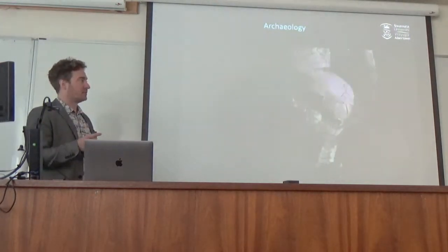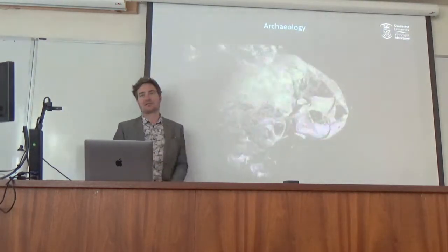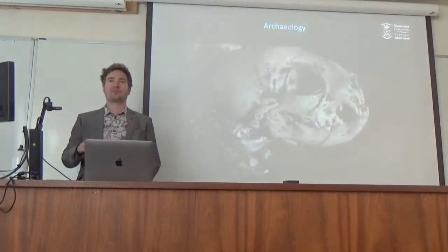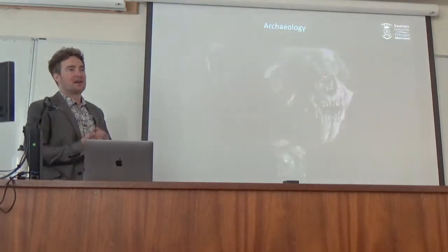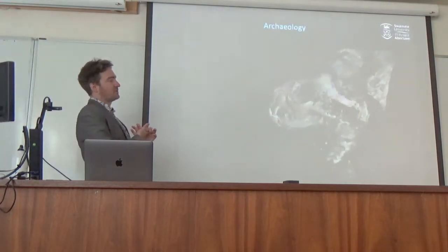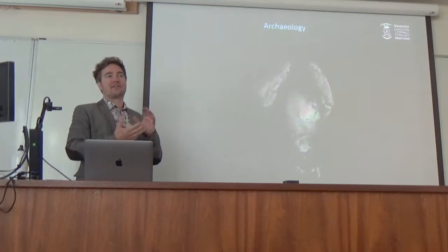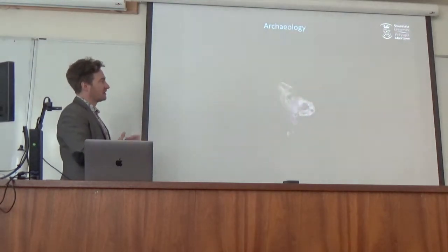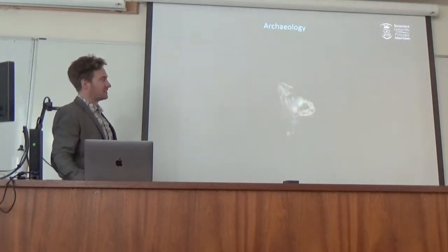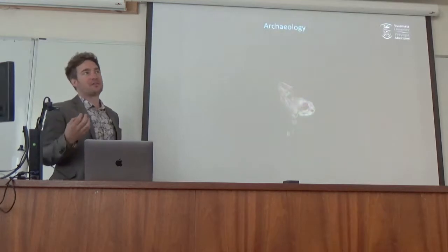So when we're collaborating with an expert on animal bones across the country, the visualization becomes so important. We want it to be accurate, but it's hard to get it usable because they're not able to manipulate 3D data, so I have to create some kind of output that they're able to analyze accurately. And for this, the interesting features we could see were damage to the skull, so I wanted them to look at that and try and interpret whether it was damage that happened pre or post-death.